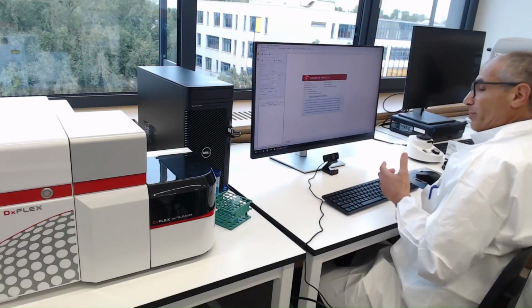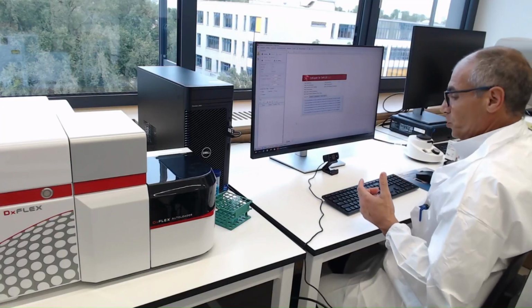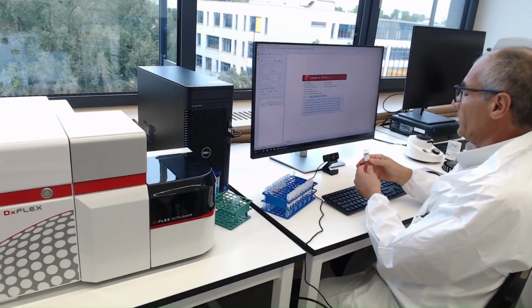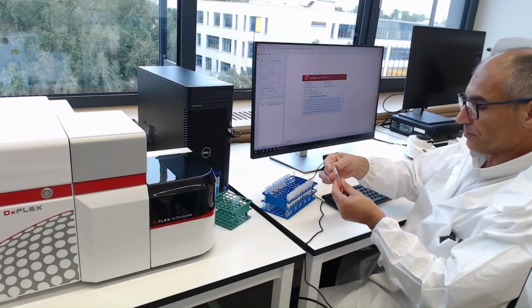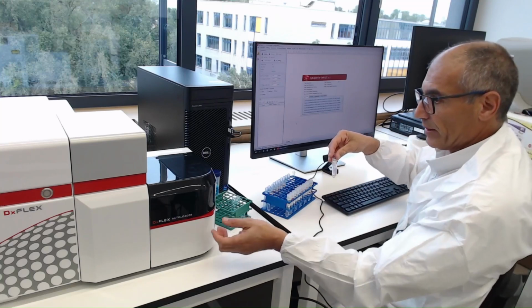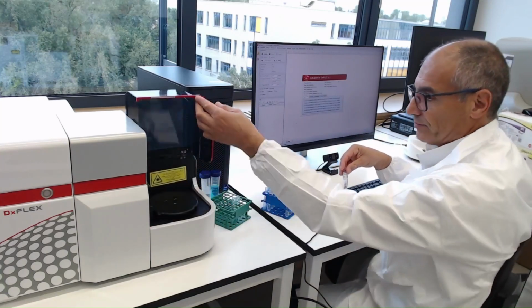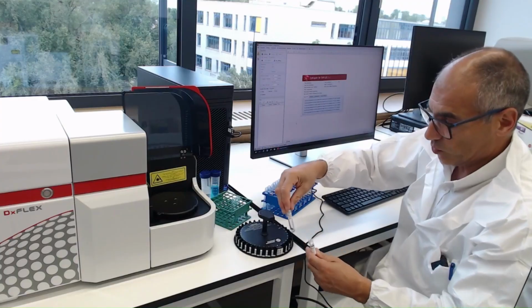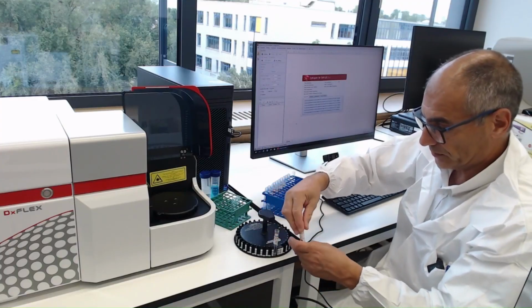So I have already prepared both tubes based on the instruction for use. So I have the abnormal M1 and M2. I will put them in the carousel in position 1 and 2.